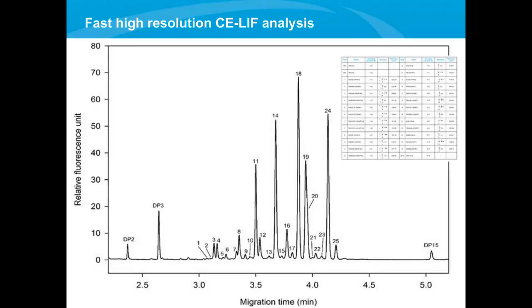And then, after the sample preparation, we inject our sample in the capillary electrophoresis unit. We have a 20 centimeter separation distance, and as one can see, in a little bit more than 4 minutes, we got full separation of all of those glycans which were released. This example is from a human IgG molecule that was prepared using this technology that I just showed.